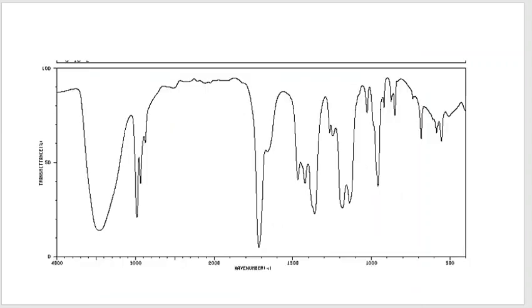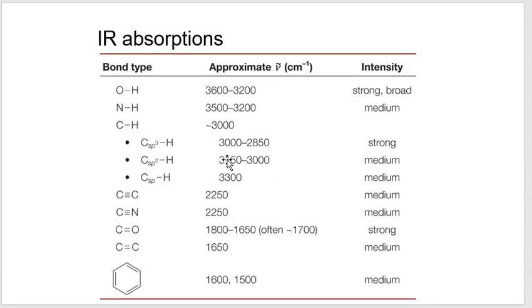And so going back to the same IR that we saw in the previous recording, we have a band around 3,500, one around 1,700, and then this 3,000 band. Looking at what this probably is, it's an OH, and then a CH group for that 3,000. And then we also have the carbonyl around 1,700.